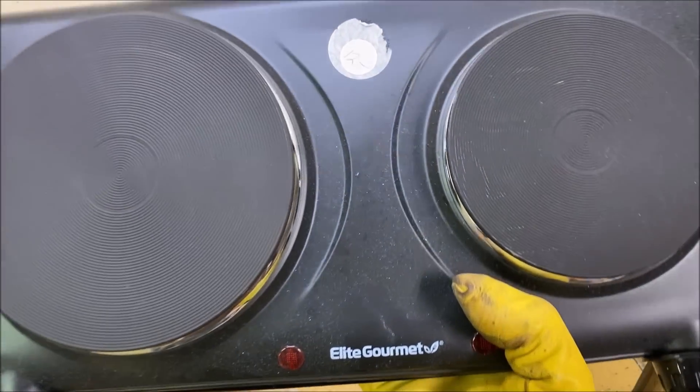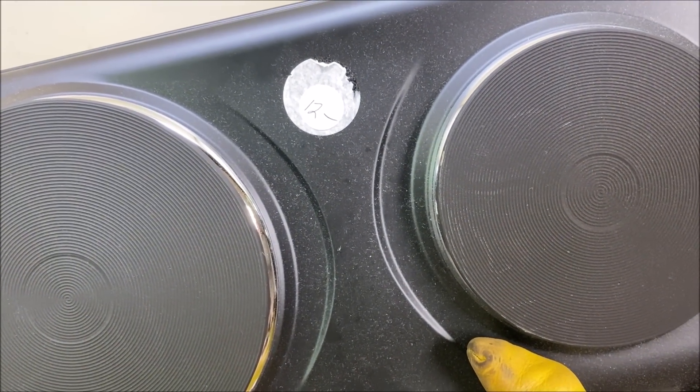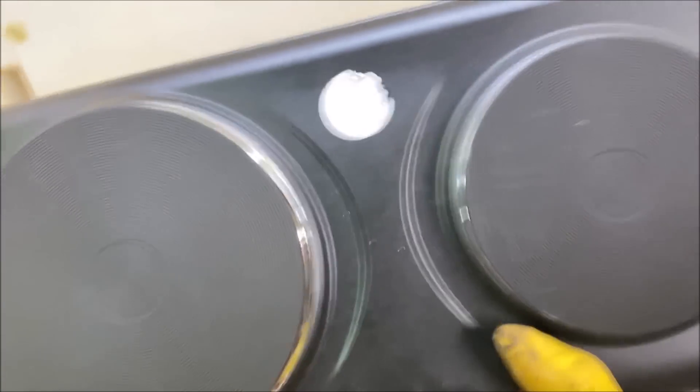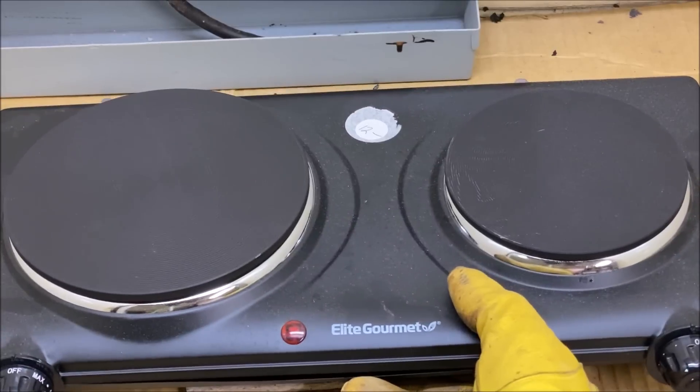I've got a nice double burner — paid 12 bucks for it at an estate sale. We're going to get this set up now to dry off our gold powder.